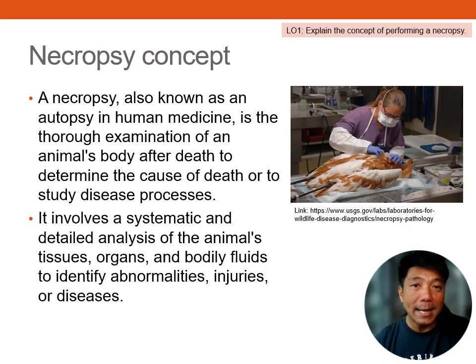So what exactly is a necropsy? Similar to an autopsy in human medicine, a necropsy involves a thorough examination of an animal's body after death to determine the cause of death or to study disease processes.